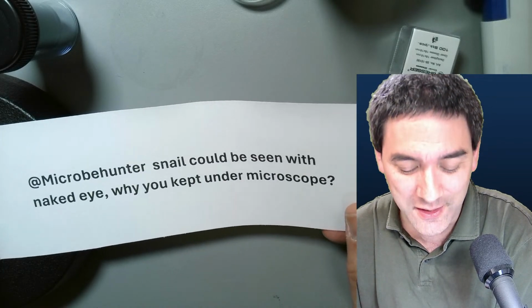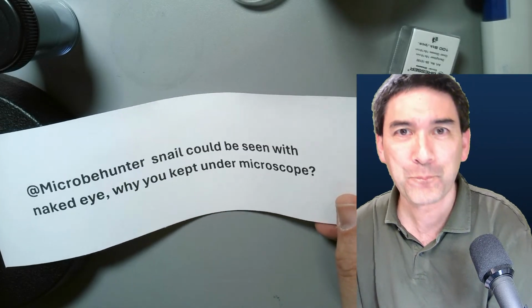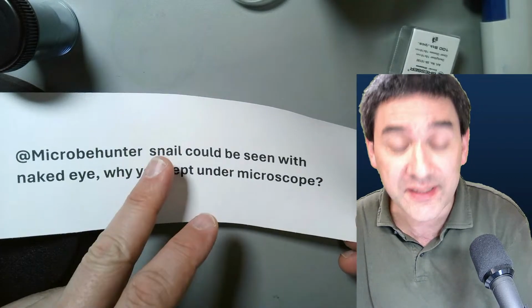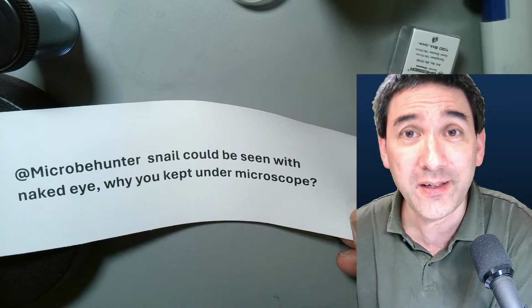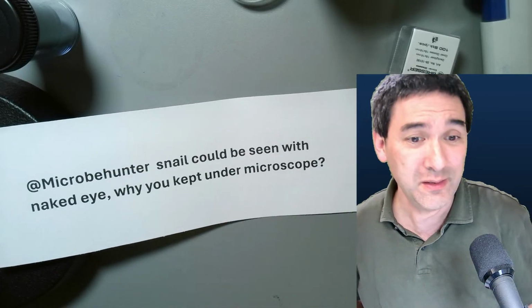The snail was a tiny snail that can be seen without a microscope, so why do you even need a microscope? And the answer is, of course, if you look at things under the microscope, you see them much better. Where did I get the snail from? In one of the videos that I just released yesterday, I made a mini aquarium for water fleas, and there were some snails in there as well.